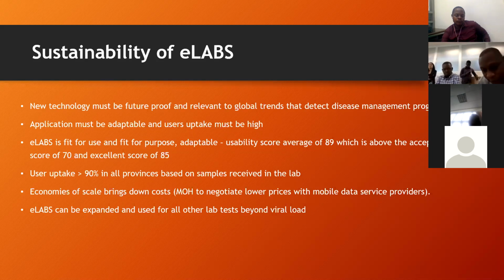Wrap up quickly. So the sustainability of eLABS is that eLABS is fit for use, it's fit for purpose, it's adaptable, its user average score is 89%, of which the acceptable is 70 and an excellent score is 85. Its user uptake is over 90% in all provinces based on samples received at the lab. eLABS can also be expanded and used for other lab tests. And once it's expanded to other provinces and all facilities across Zambia, the MOH can negotiate lower prices for mobile data provision through the economies of scale.